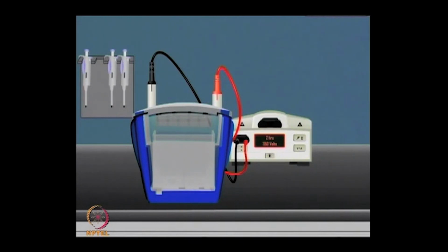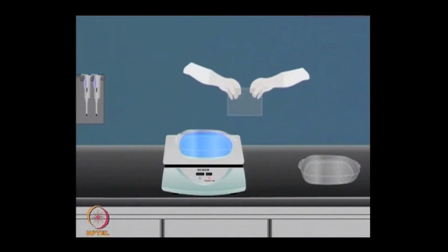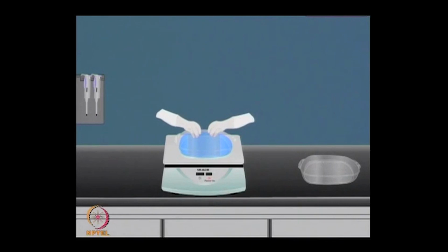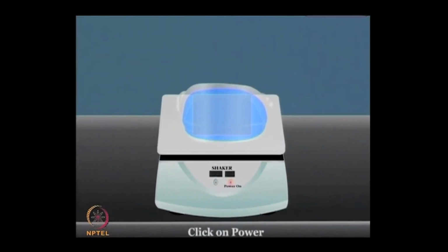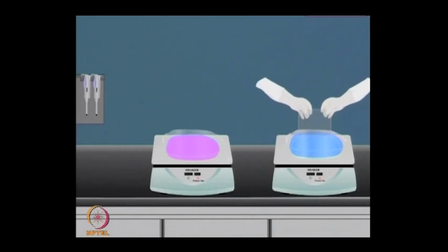Depending on the gel length, you can perform the second dimension separation for a few hours. After second dimension separation is done, then we can perform the staining and de-staining. So, this process involves removal of the gel from the electrophoretic assembly, followed by treatment with a fixing solution, staining solution and finally, the de-staining solution.